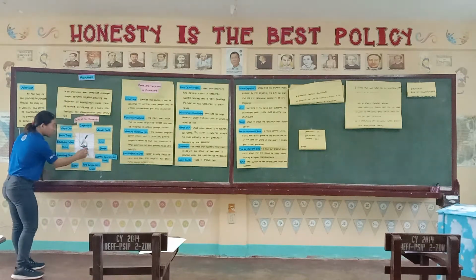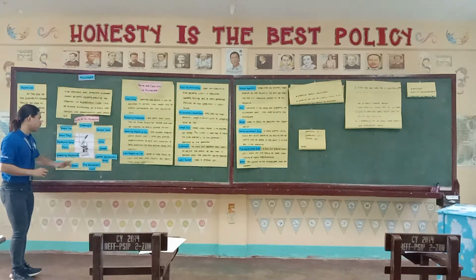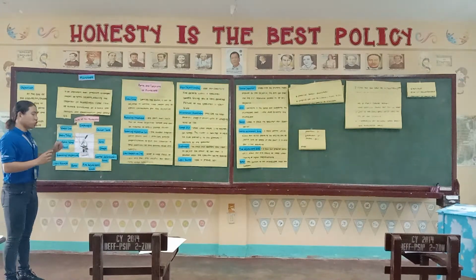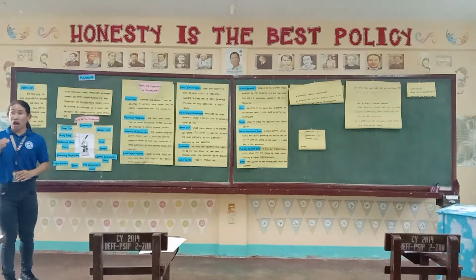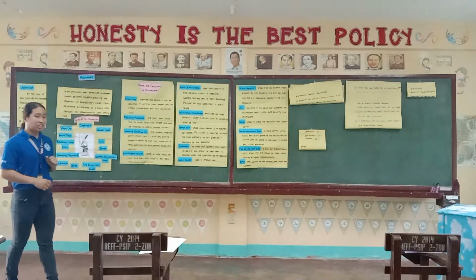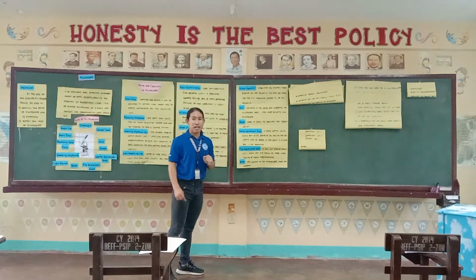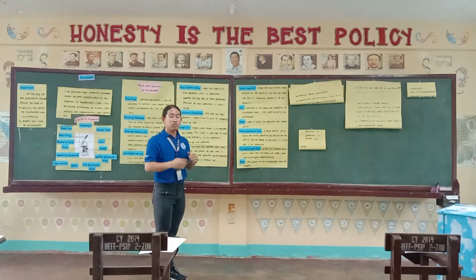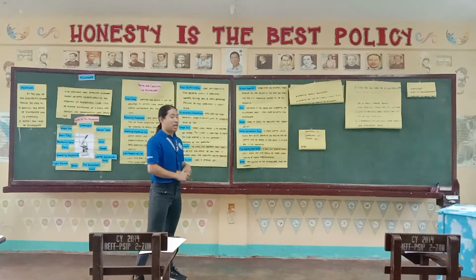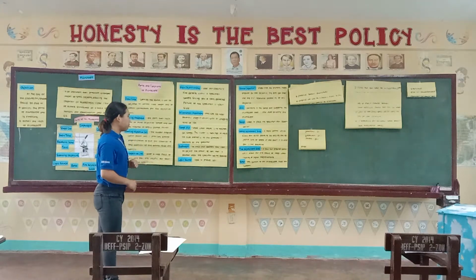So pwede mo na siya i-adjust para ma-up and down ang stage. O kung sa kagusto mo whether close view or down view ang imong paglantaw or pag-examine sa isa ka specimen. So that is the coarse adjustment knob. From the term itself, coarse adjustment knob meaning ma-adjustan nimo siya o ma-control nimo ang specimen na imong gi-focus. So the fine adjustment knob.